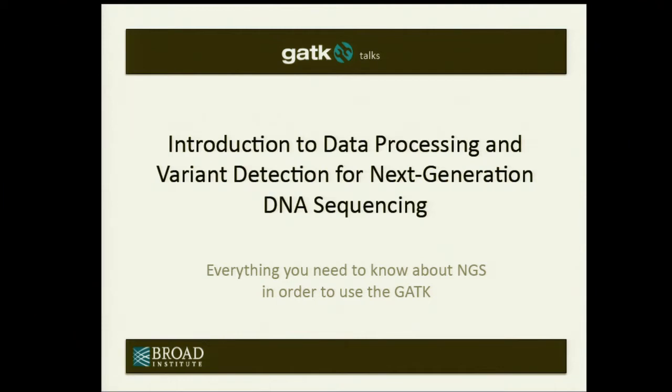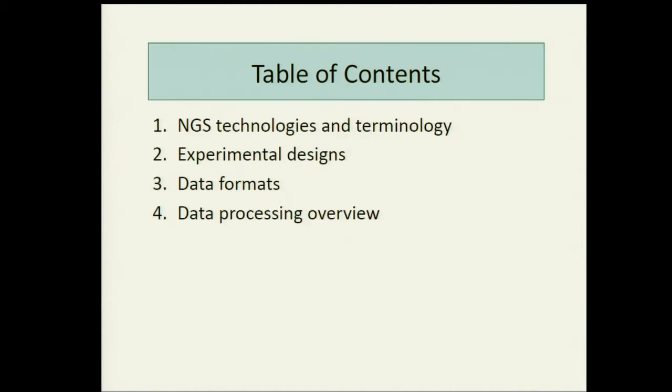So I'm going to give you a very fast, furiously paced overview of next-generation sequencing data from start to finish. All right, let's see if I can use the pointer. Great. So this is the flow today. We'll talk generally about next-generation sequencing, NGS technologies. We'll talk about some experimental designs for the projects you might want to have if you ever do a sequencing project through NGS. Some of the data formats.